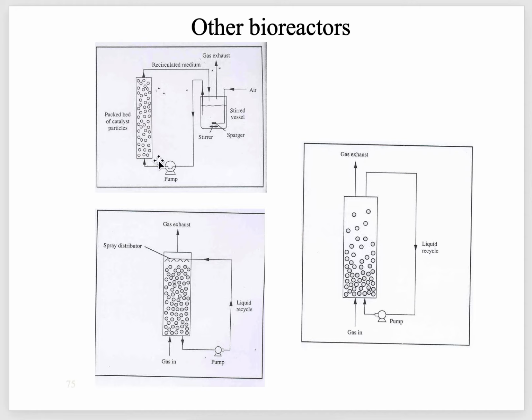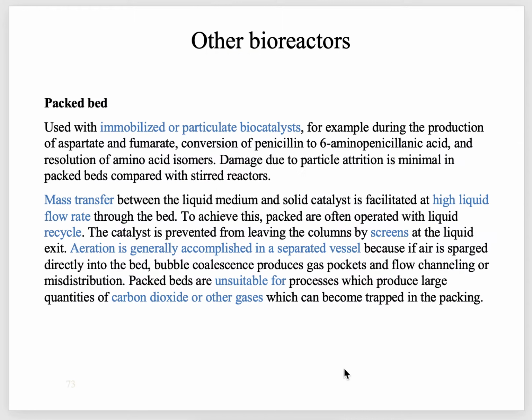The media will travel upward, and then again you can recycle it and pump it here. In this way we can increase the mass transfer.